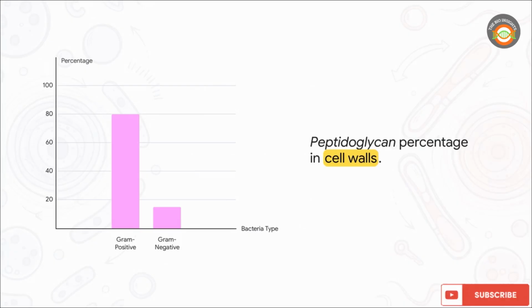To understand why they stain so differently, we really have to zoom in closely and examine the physical armor protecting these microbial suspects. It all comes down to a protective shell wrapped around their inner plasma membrane. This armor is the cell wall, which is largely made up of a complex polymer of sugars and amino acids called peptidoglycan.